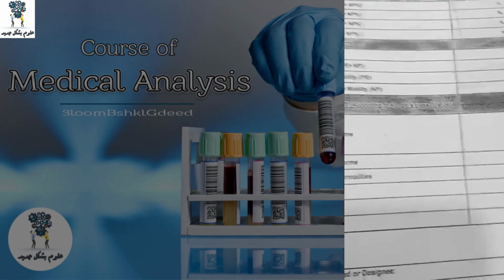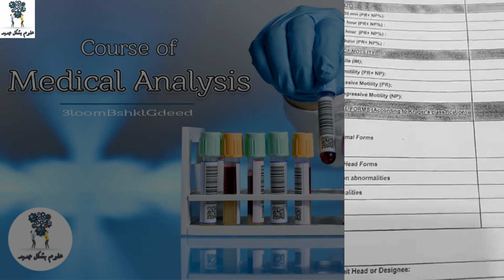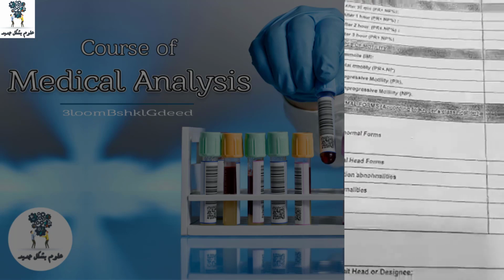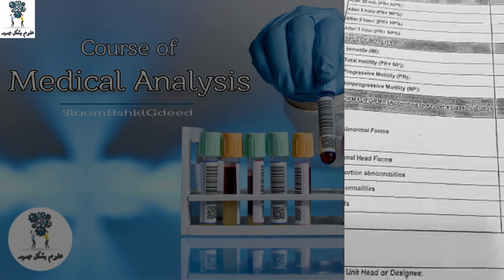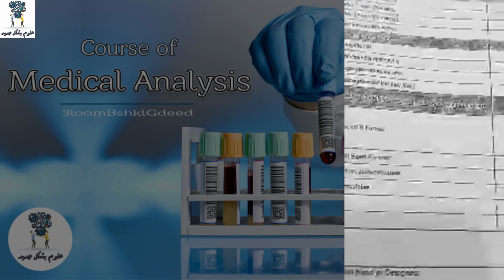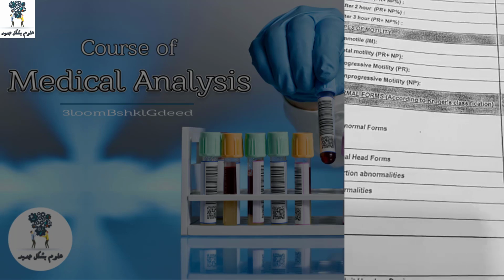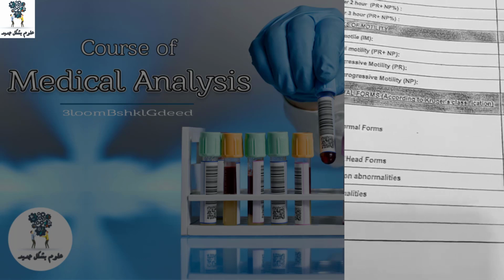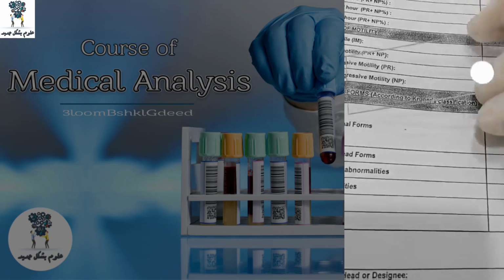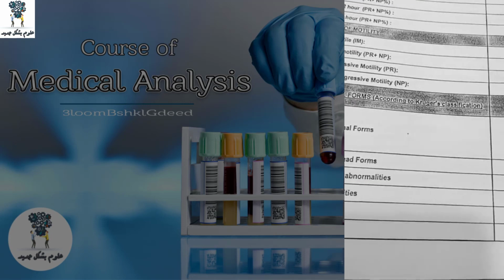إيه الفيتاليتي تيست؟ هي تحليل بيتعمل، ممكن الدكتور يطلب، ممكن تجيلك روشتة فيتاليتي تيست بس. على فكرة انت بتعمل الريبورت الاناليسيس وبتعمل الفيتاليتي تيست. الفيتاليتي تيست دي عبارة عن إيه؟ إنك بتاخد صبغة اسمها ايوزين موجودة في المعمل، لونها بينك شوية، بتاخد منها 20 مايكرو وتحط 20 مايكرو من الليكويد بتاع السيمن وتعمل لهم ميكس، بقوا 40 مايكرو، تاخد من الـ40 مايكرو دول 10 مايكرو على السلايد العادية وتفحصه عادي كأنه فحص عينة.